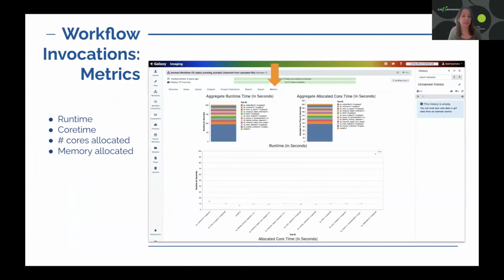And finally, the metrics are giving you some information about the runtime and about the memory that it's using. That's also interesting to observe, because sometimes we lose this perspective of how much resources we are using when we are running these things, right? And this is actually consuming resources that are harmful for the planet in general. So that's also something to pay attention to. You can also measure the performance of the different tools and see that maybe there is one that is more efficient than another, and these kinds of things.